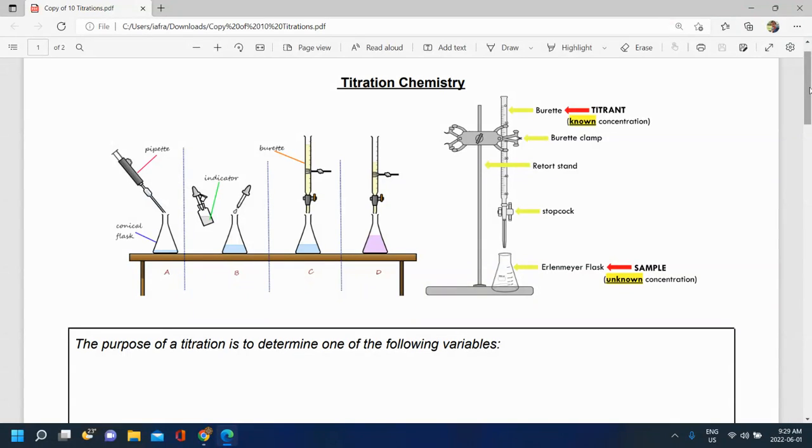It has a very fancy setup or it looks kind of fancy. This is our setup over here. As you can see there's this little tool called the burette and there's also another piece of lab equipment that we call an Erlenmeyer flask.